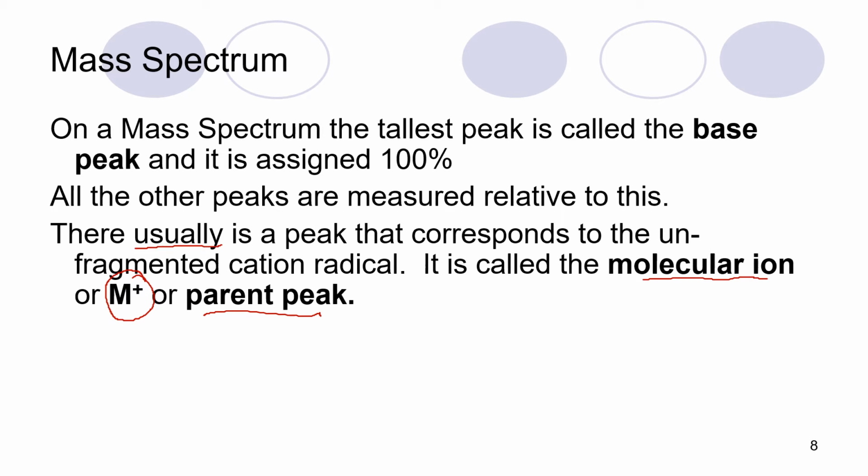See the word usually. Sometimes the molecular ion peak is totally unstable and will break apart. So you don't always see it, which is a shame because that can give you some good information.